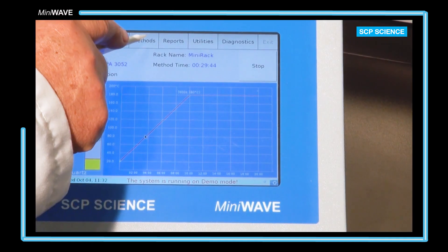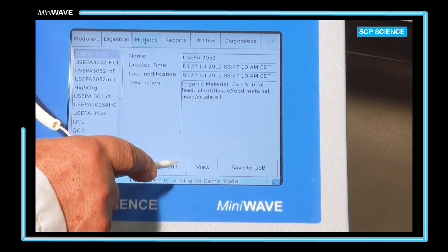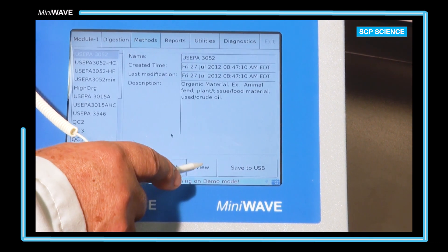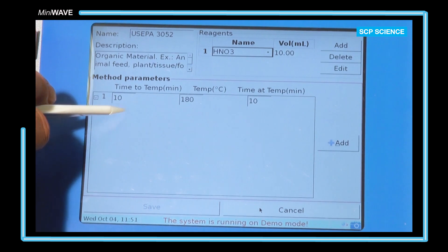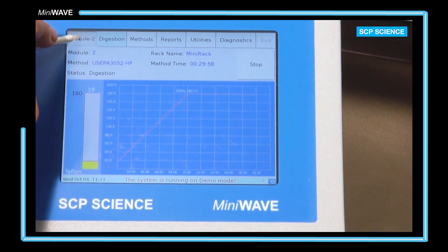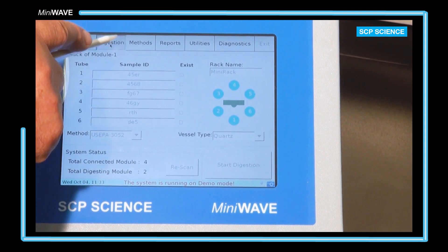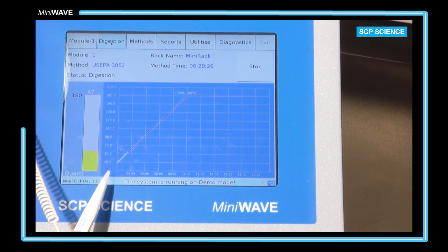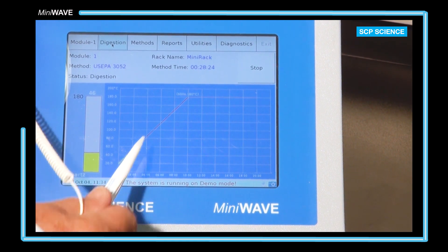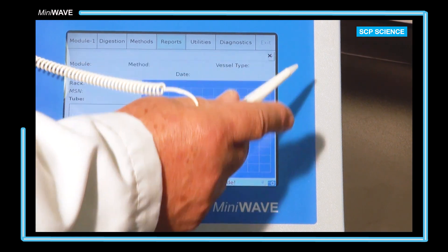From the methods tab, the user can edit, view, and create a method. This particular method requires 10 minutes to come to 180 degrees Celsius and holding for 10 minutes, with 10 milliliters of nitric acid added to the sample. If there is more than one MiniWave connected, clicking the module tab will toggle between them. The red line represents the target temperature at a specific time and the yellow line represents the actual temperature profile of the digestion.